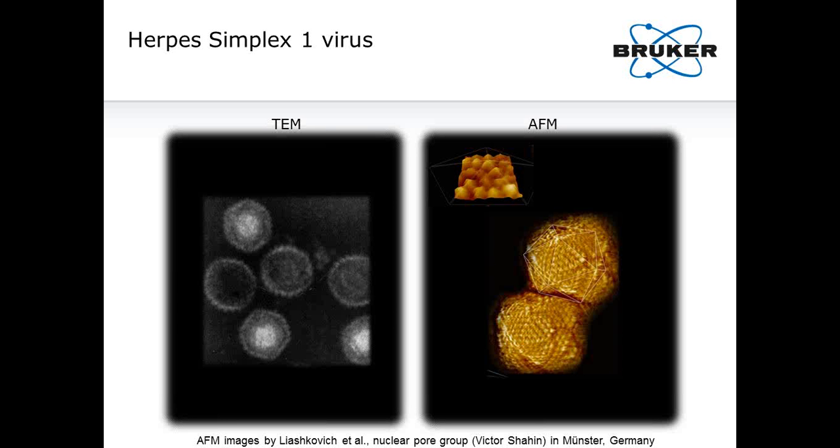This example shows nicely the TEM's emphasis on membrane structures vertical to the image plane, and the AFM's emphasis on the three-dimensional structure of the same object. The resolution appears comparable by eye. The TEM has a technical lateral resolution that can be higher than the AFM's. However, this assumes that the sample structures are sufficiently well prepared during the often invasive TEM prep, and that the contrasting agent finds enough binding sites to bring out the resolution. It would be interesting to compare TEM and AFM of virus particles in routine virus particle ID.